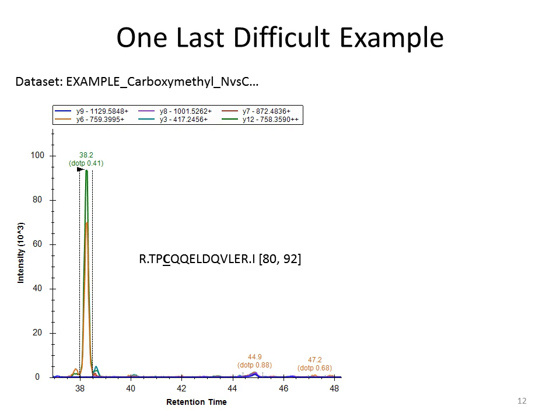Okay, so this is the last difficult example we have with a spectral library. So the peptide shown there, you can jump ahead to it. And the question is, is it this one? Or is it the 0.88 dot product? Or the 0.68?